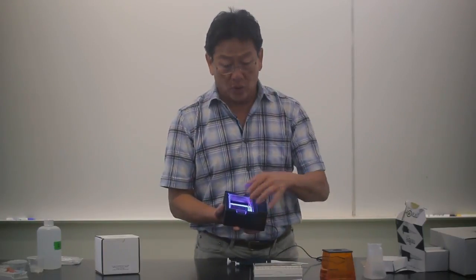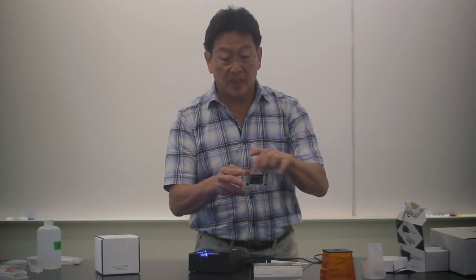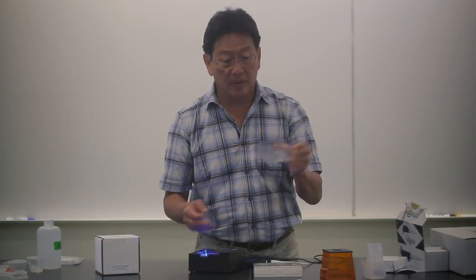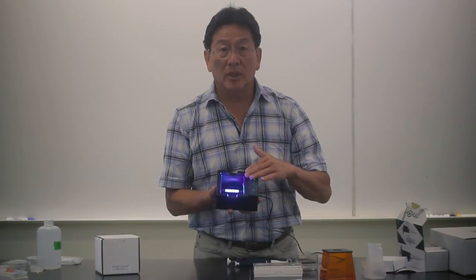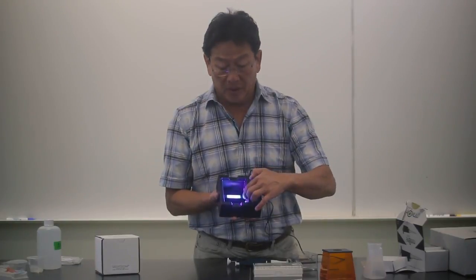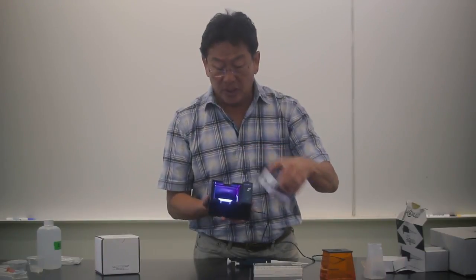While I have the light on, let me show you that this actually comes with the running tank. The running tank comes with the electrode and a black platform for the visualization of the gels, and it takes about 125 mils of buffer. Very compact, and the electrodes are made with carbon graphite, so it's very durable — fairly hard and sturdy, not like wires that break when you touch them. This connects into the control unit where power is applied, as well as the blue light for illumination. There are essentially six LEDs on each side, and they illuminate the gels so you can actually see it when it's running.